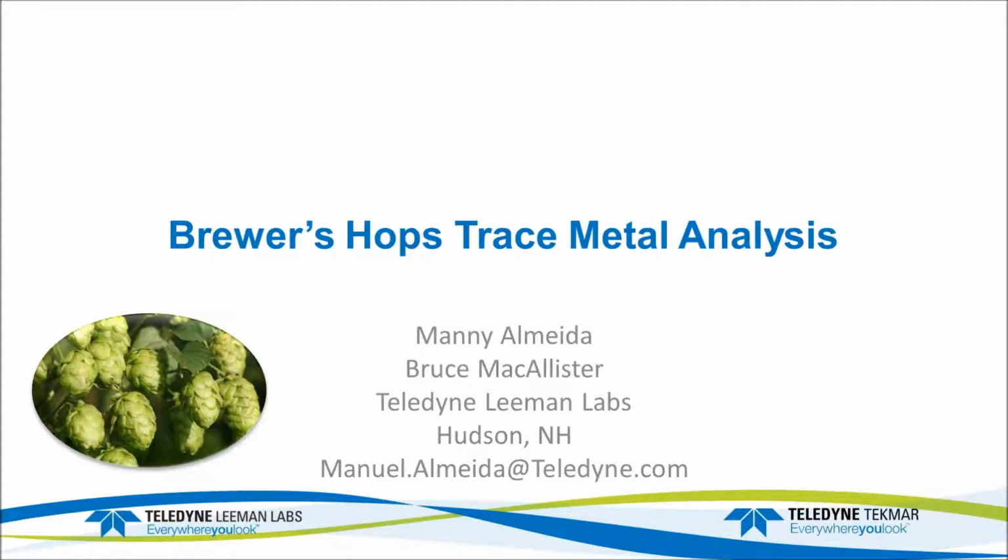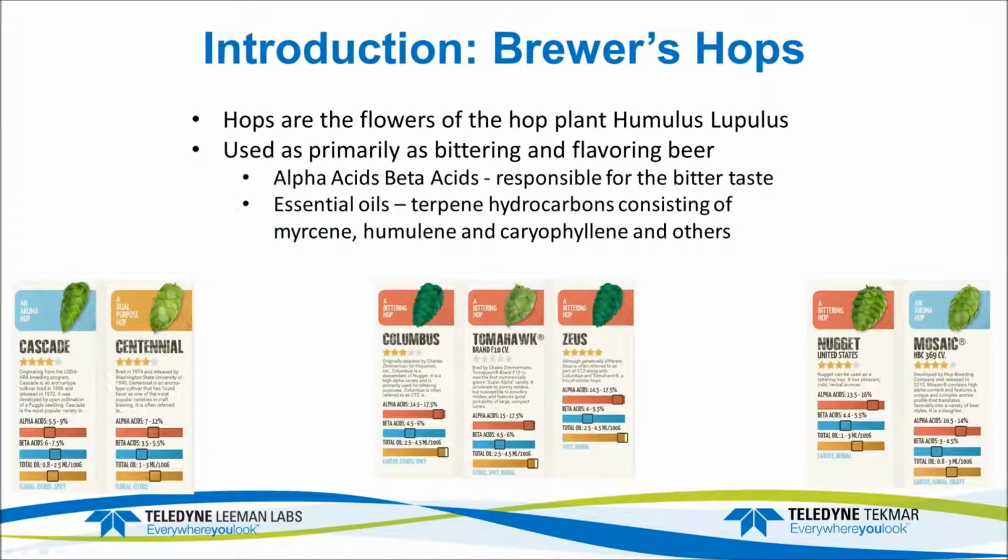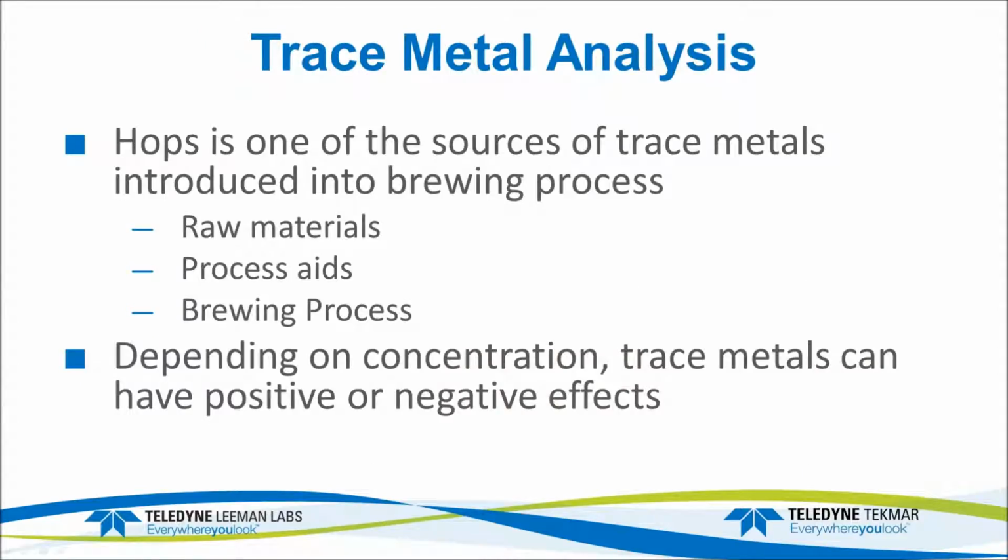I'm the ICP product manager at Teledyne Leeman Labs, and we did the trace metal analysis portion for this hops work. We did the trace metal analysis on two versions of the hops. We used the Nugget and the Centennial hops. We did not do some of the other ones. Those are the ones that we were sent. I had no idea there were so many different hop types. That's one thing I've learned through this work.